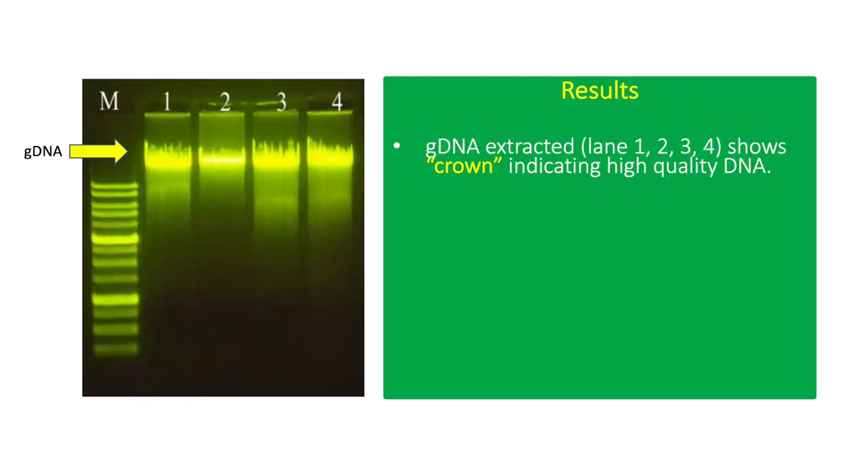This is an actual result showing genomic DNA extracted from bacterial culture using the Phenol-Chloroform method. The GDNA shows a crown-like appearance, which indicates high-quality DNA with minimal degradation.